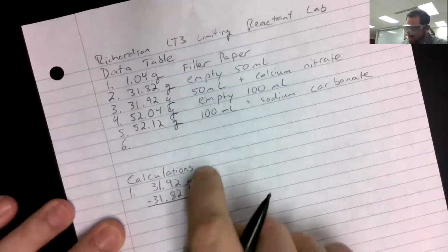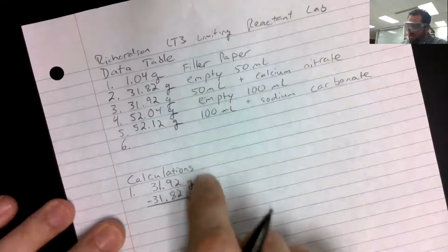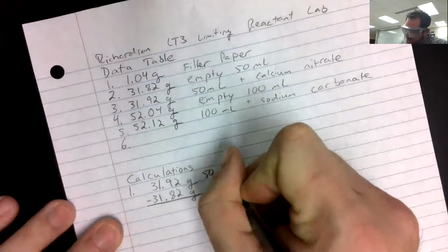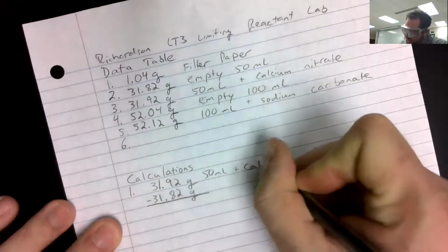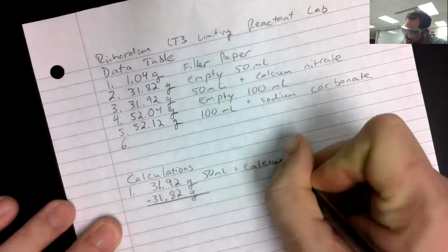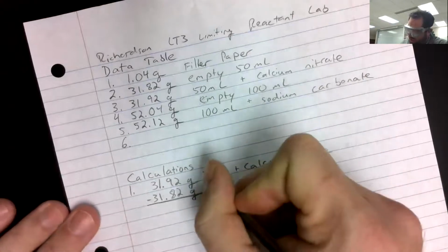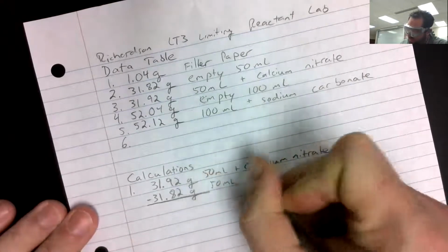In units behind everything. In fact, this one probably should say 50 milliliter beaker plus calcium nitrate. And this one probably should say just 50 milliliter beaker.